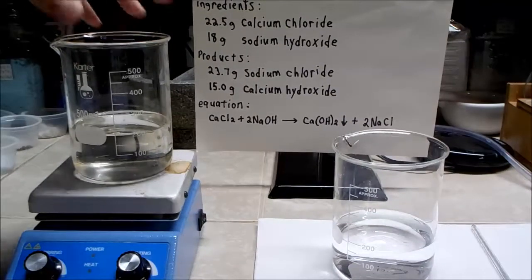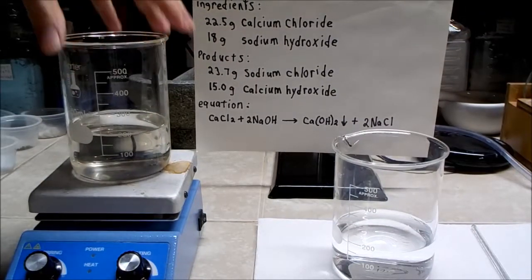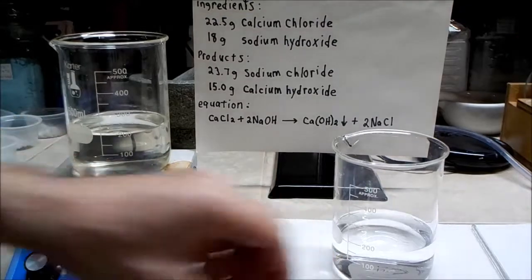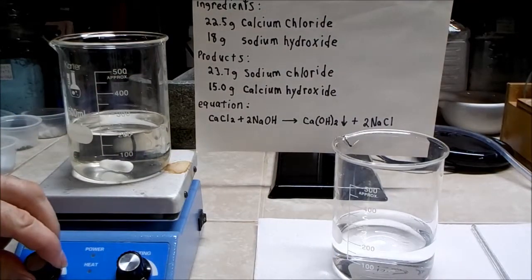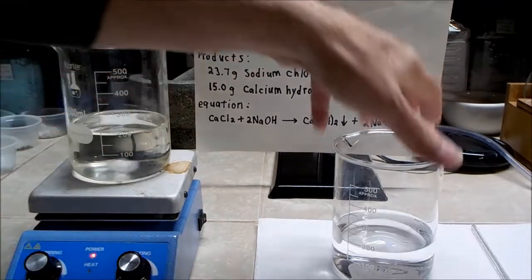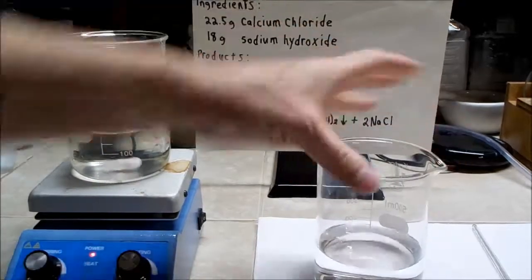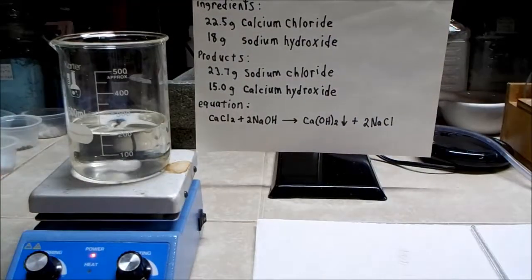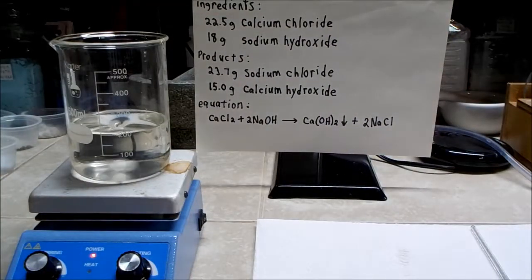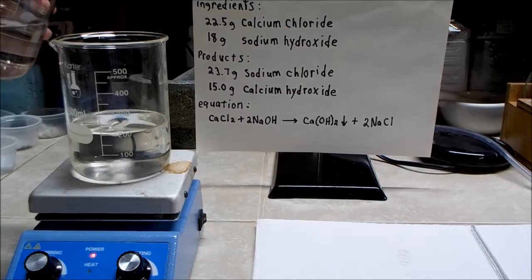All right, so I've got the calcium chloride solution up here on the hot plate, so I'll throw in a stir bar, turn that on. I'm going to slowly add the sodium hydroxide, and I've never tried this before, so I don't know exactly how it's going to go, so we'll both see it together.